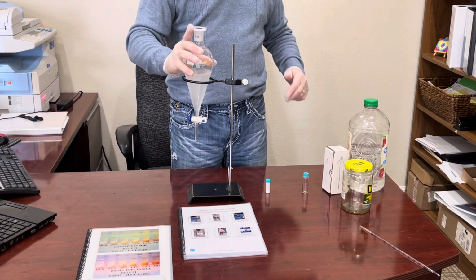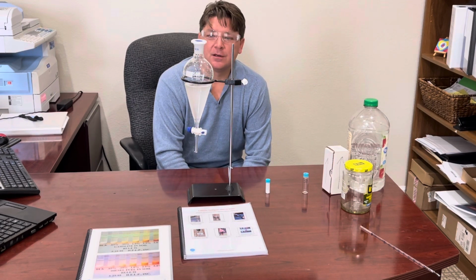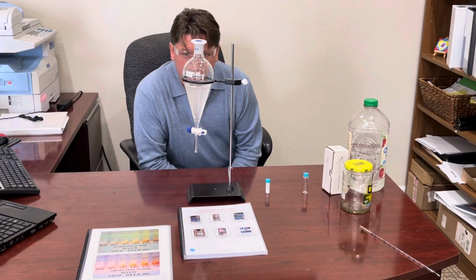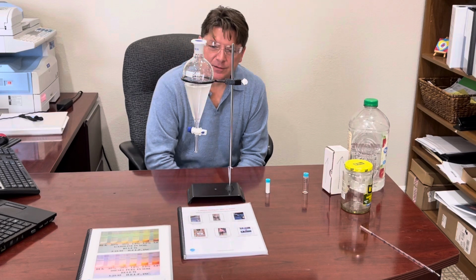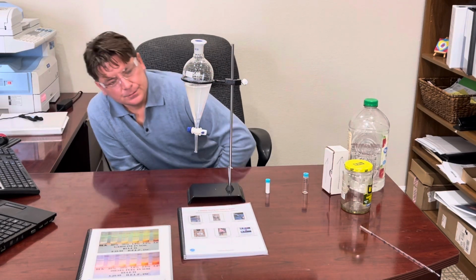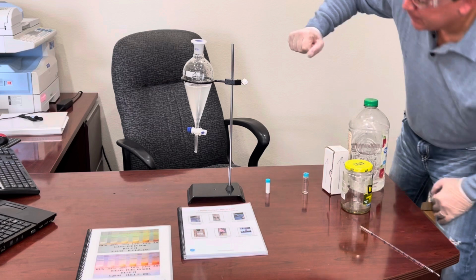And now we're going to let it settle so we can see some separation between that solvent and that water. The solvent should separate and be floating on top of the water. We can start seeing a layer start to develop here on top of the water, which is our extract solvent floating. See the separation layer, but we're just going to give it a little bit more time just to make it more prominent. Let's see from your side if you can see the layer. Yeah, you can see the layer right there separated out on top.